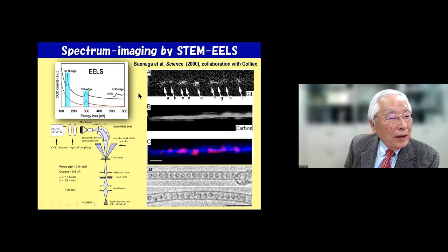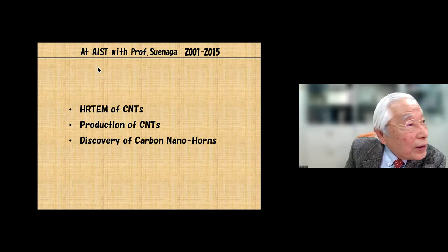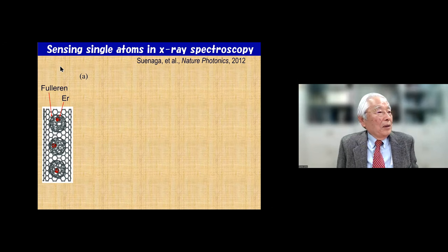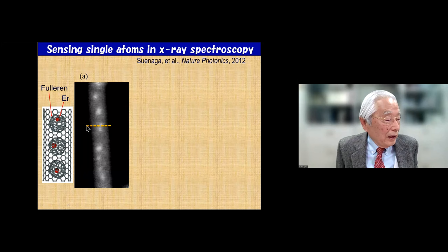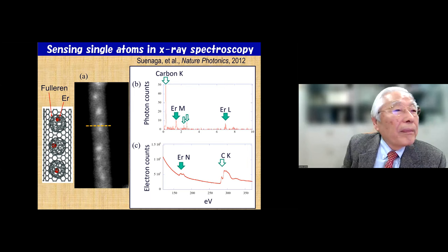Now I moved to AIST, a government research program. Suenaga-san continued to do the microscopy. This time we had the metallofullerene again, but this time not only EELS; he also looked at the X-ray emission from the metal.